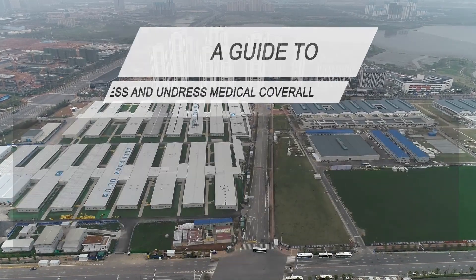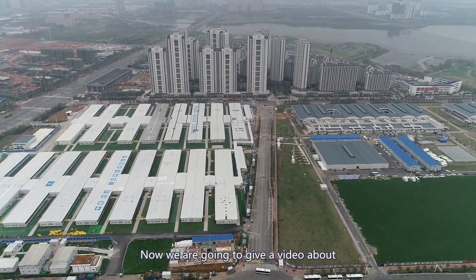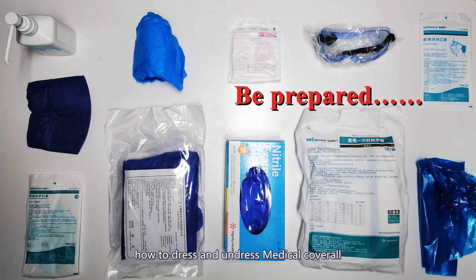This is Lei Shenshan Hospital. We are going to give a video about how to dress and undress a medical coverall.